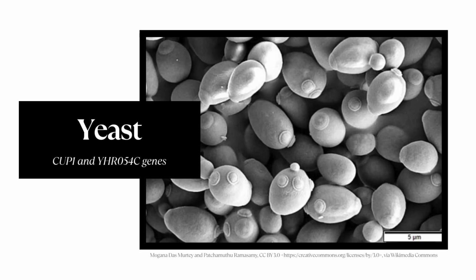In this video, we are going to be looking at structural rearrangements present in the CUP1 region of the yeast genome. Just as a reminder, the CUP1 gene is a copper metallothionein gene. In other words, this gene helps the yeast to survive in the presence of copper and other heavy metals. In general, the more copies of the CUP1 gene a yeast accession has in its genome, the better it will be at surviving under these conditions.